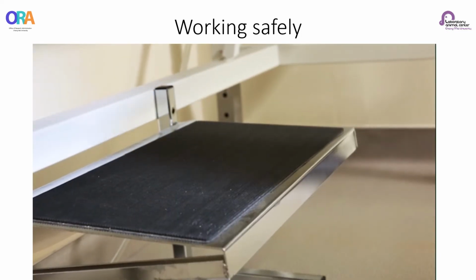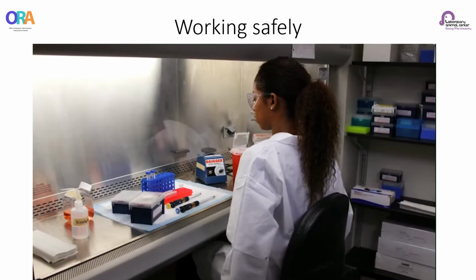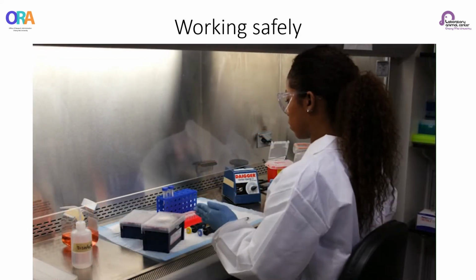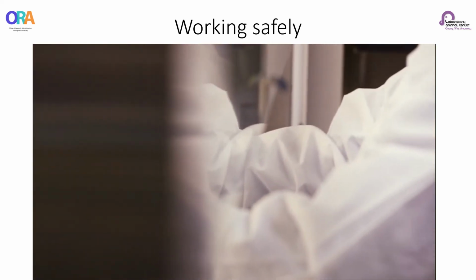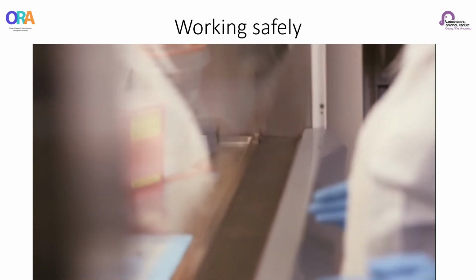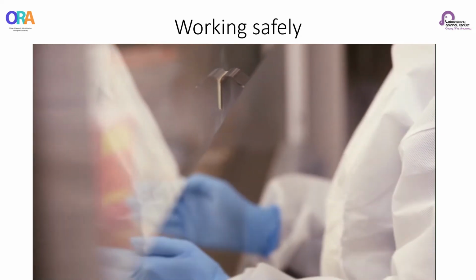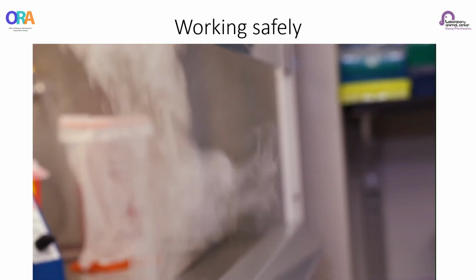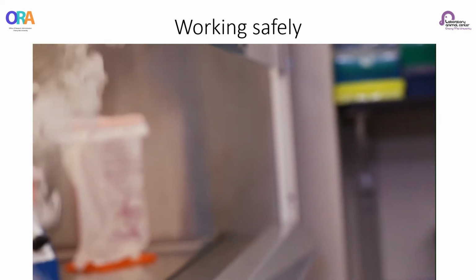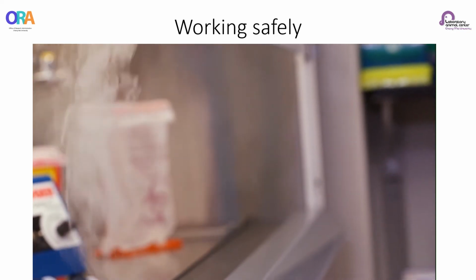Use a foot support if your legs do not reach the floor or if needed for back comfort. Minimize entering and exiting the BSC. If you need to exit and enter the BSC, pull your arms straight out and insert your arms straight in, perpendicular to the opening. This will minimize air being pulled out of the cabinet and into the breathing zone of the person sitting at the BSC, as illustrated previously with the smoke machine.